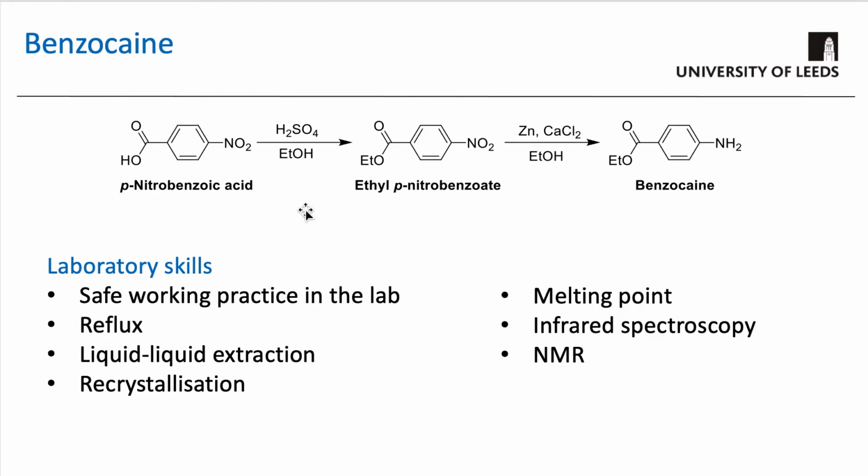After you've done your first reaction, you check that the product is the right product and that it's pure as well, so that you can then use it in the second stage. You've also got to make sure that you have enough from your earlier steps to carry through into the later steps.